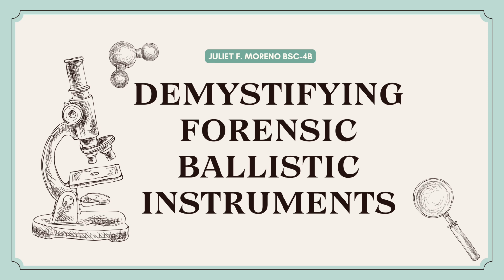Let's now discuss those instruments that are used in forensic ballistics. These instruments allow examiners to see details invisible to the naked eye. They ensure that the analysis of bullets, cartridge cases, and other evidence is precise, reliable, and legally admissible. Each tool has a unique role in this process, from initial observation to detailed measurement and comparison.